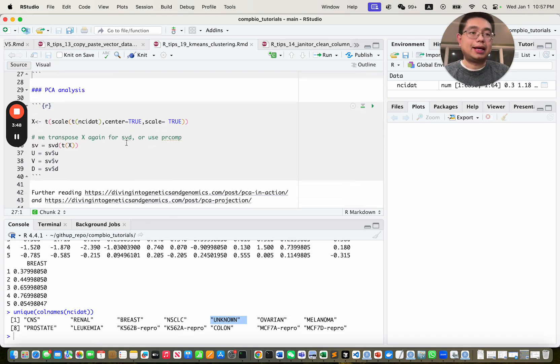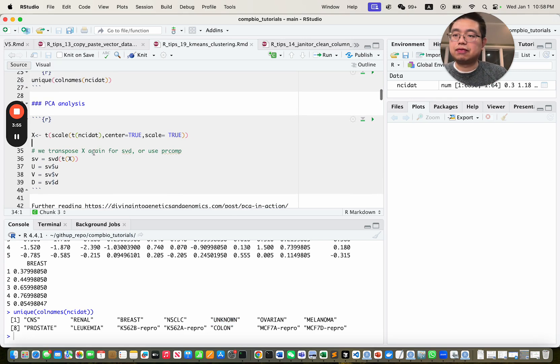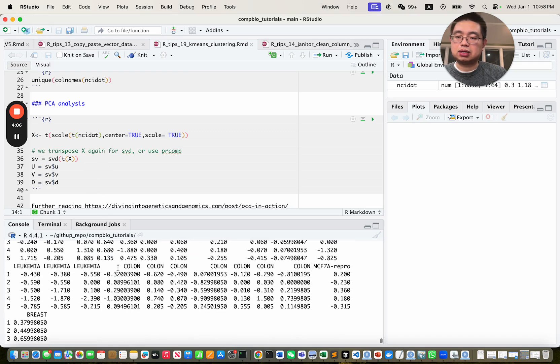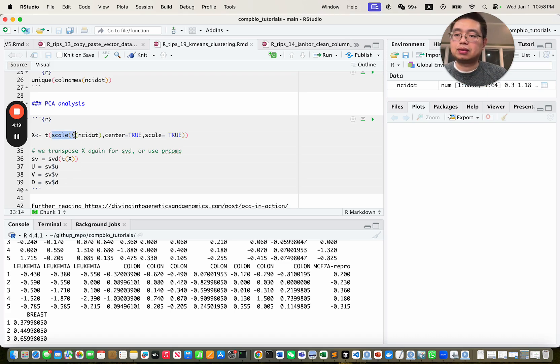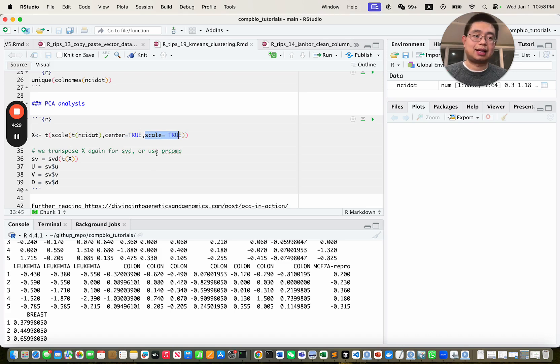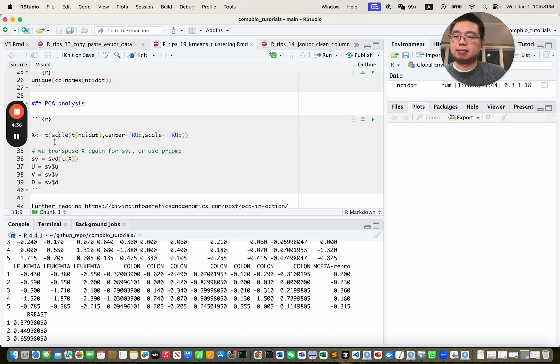Let's first do a PCA analysis — principal component analysis — to look at how the data looks. We create a new variable called x. We scale the original data matrix by rows (genes), because you don't want higher expression values of those genes to dominate your analysis. Since scale works by columns, you transpose it first, then scale with center equals true and scale equals true — essentially standardizing by subtracting the mean of the gene across samples and dividing by the standard deviation. Then we transpose it back. So x is the scaled data matrix.